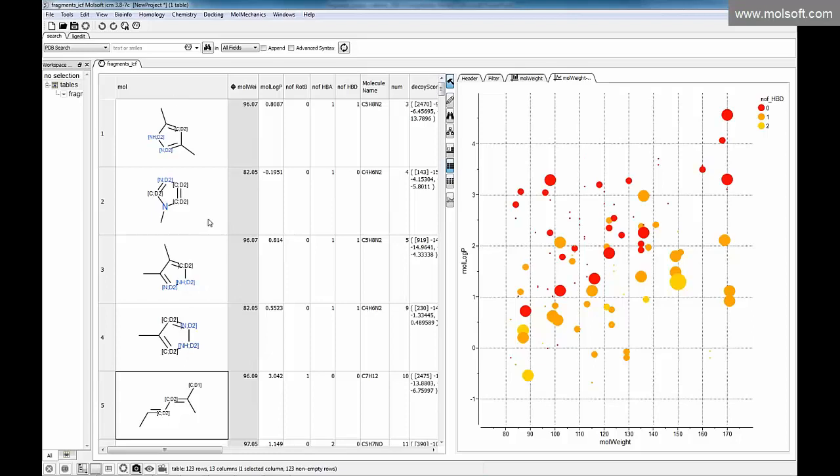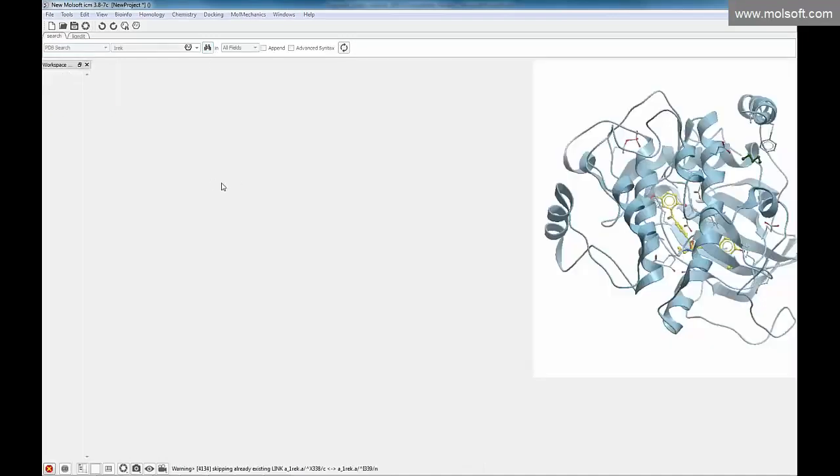So how do we dock this? We have an example. It's a cAMP-dependent protein kinase, and we need to go to the PDB. I was going to delete this table, we don't need it. It's going to go to the PDB search, and we can search for the PDB structure with the PDB code 1REK. So go to the search tab, PDB search. In this search tab we have other databases, but the one we're using is PDB. Just go OK.